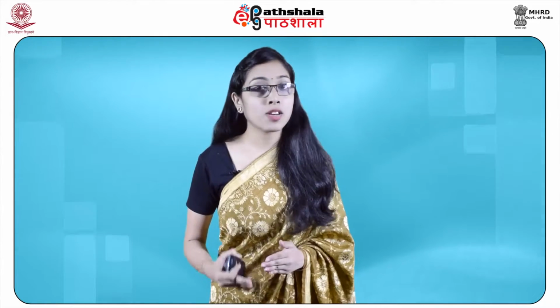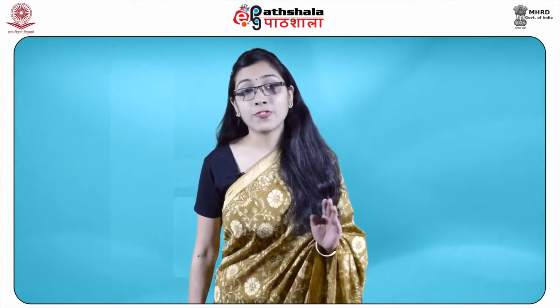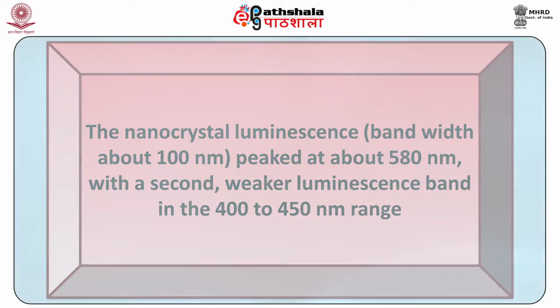They serve to determine the size of the nanocrystals, which were then deduced to have radii of 3 to 4 nanometers. The nanocrystal luminescence, having a bandwidth of about 100 nanometers, peaked at about 580 nanometers with a second, weaker luminescence band in the 400 to 450 nanometer range.